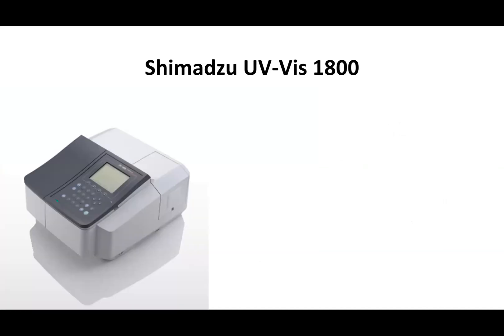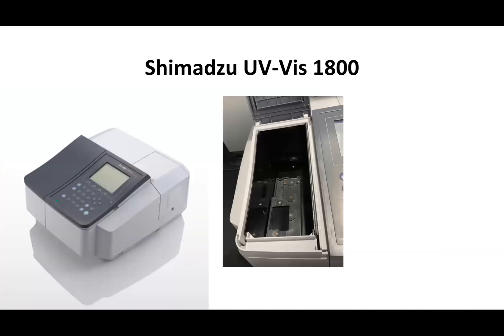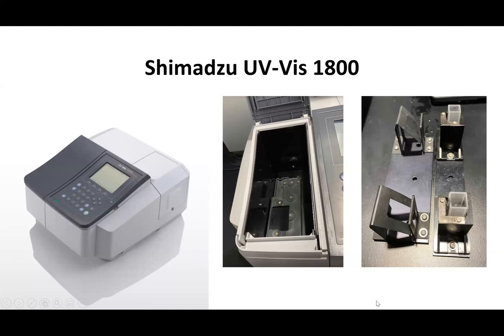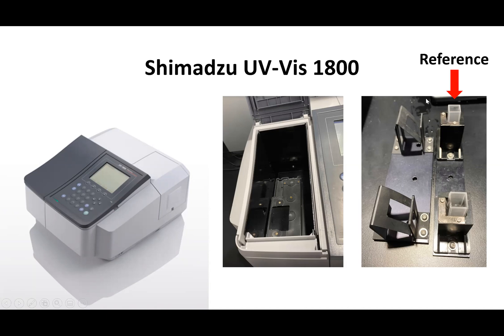Our instrument looks like this and that's where the samples go. We have two different holders - one for glass substrates that Corbin typically uses in the lab as well as for cuvettes. The one on the left is for the slides and the one on the right is for our cuvettes. The slot on the back is the one that we use to put our reference sample in and then the one on the front is for the sample of interest or the unknown.